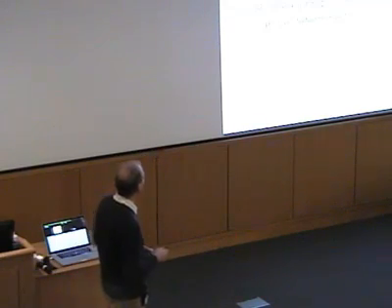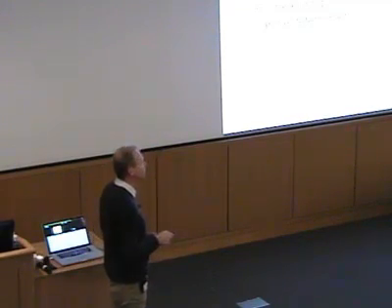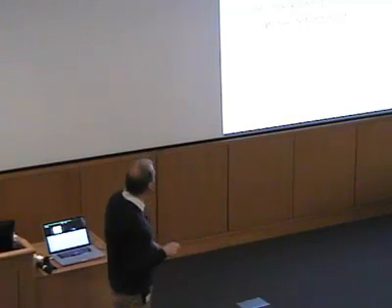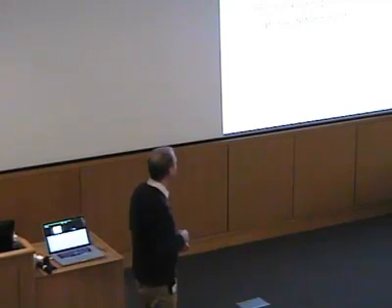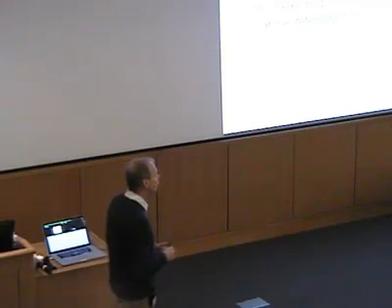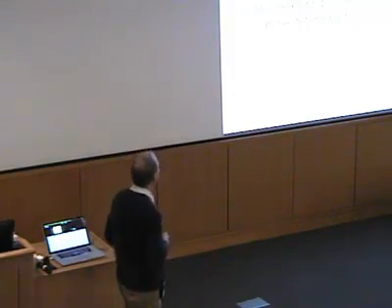I'm not going to talk about this, but we may hear some in the next talk about this: we can put stable radicals onto proteins in different locations, and then if we can measure this parameter D, we can get the distance between them, and you can use that to start to piece together the geometry of the molecule, of the protein, or we can look at conformational changes and so on if we see differences in the parameter D.